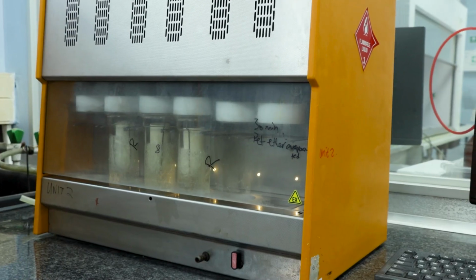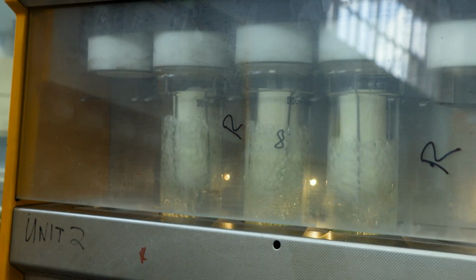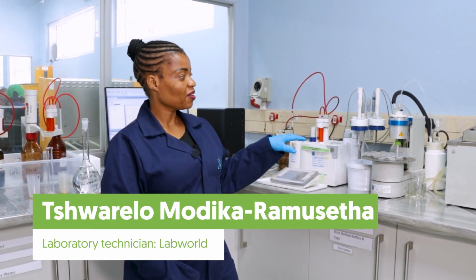I'm responsible for various fat analysis, including crude fat and fat acid hydrolysis. Here we run the crude fat and the fatty AH. And then depending on the type of samples, we also do the Bligh & Dyer and the Rose Gottlieb fat analysis.